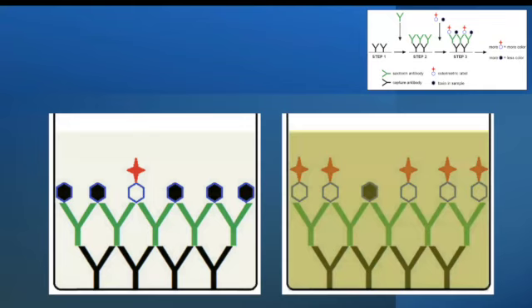It is very important to stop the reactions when the color of your sample is within the colors of your standard curve. You can watch our data analysis training video for more information and visualization as to why this is so important. But the short answer is that the results are only going to be valid for sample colors and sample concentrations that fall within the range of the colors of your standard curve.